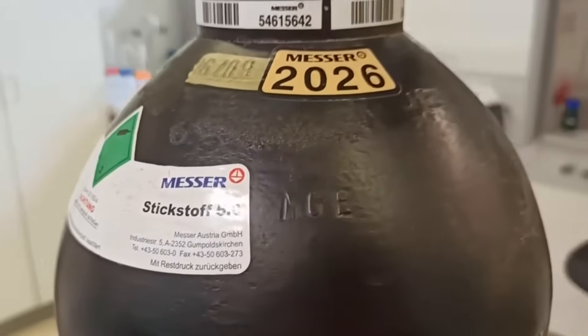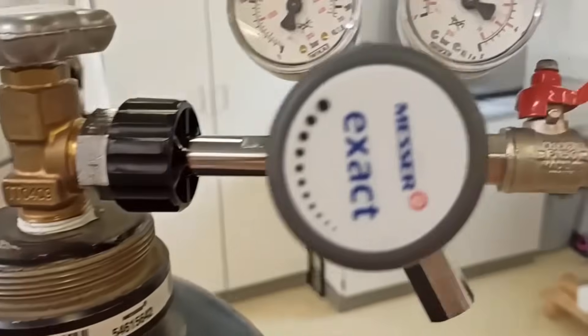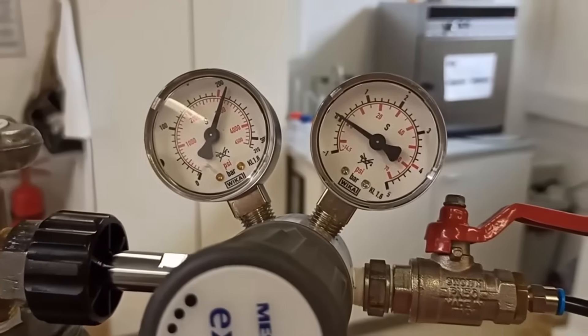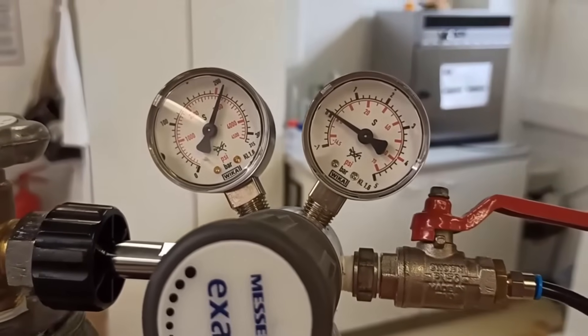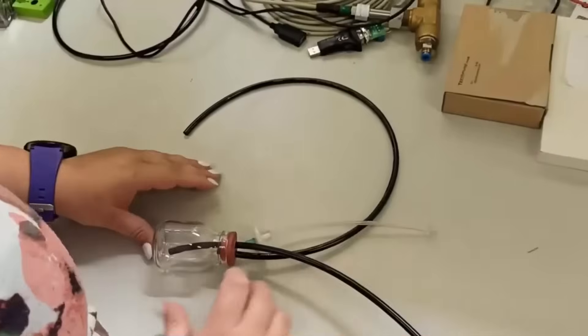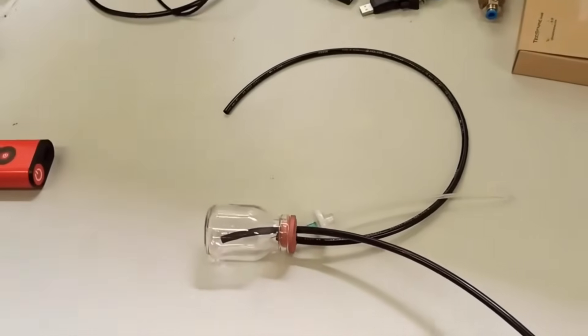TechSense recommends using Nitrogen 5.0 for the adjustment with a flow of 1 liter per minute. Be aware with the handling of Nitrogen. Only qualified persons should handle Nitrogen.